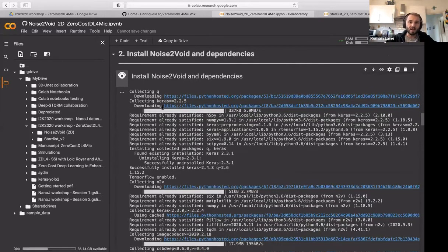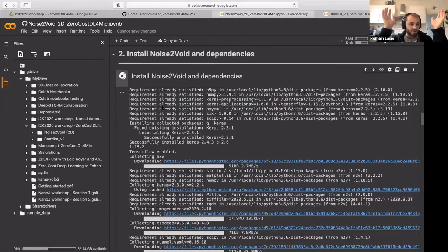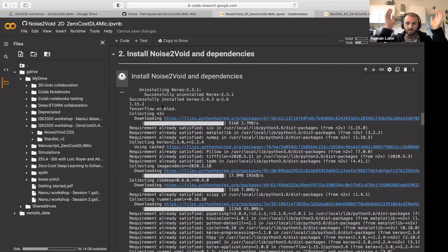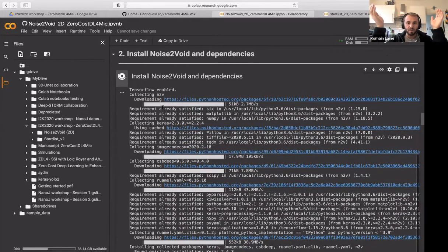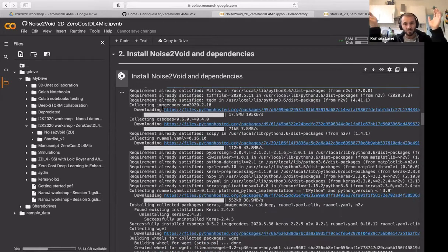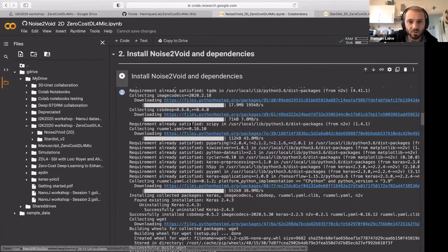And that's one clear advantage of running things in a bit of a sandbox in the cloud. Those libraries need to be installed in different ways for different networks. So if you were running several networks on the same machine, you would probably have to reset the machine quite extensively for each network that you need to use. And that makes it very difficult to actually use local machines because of this.